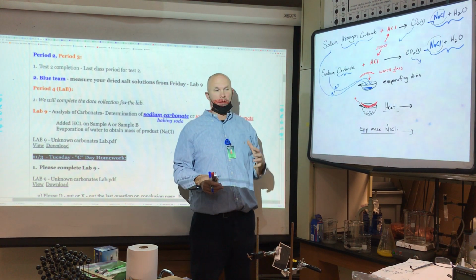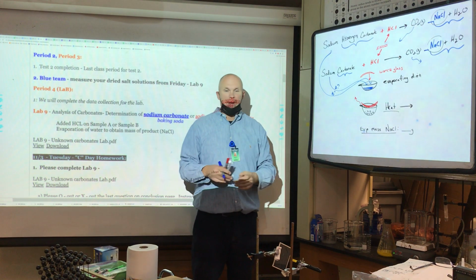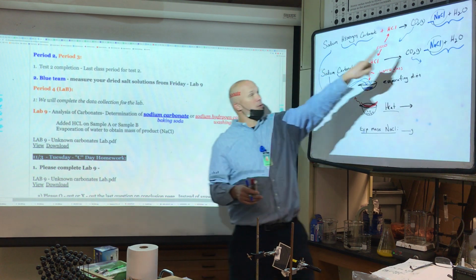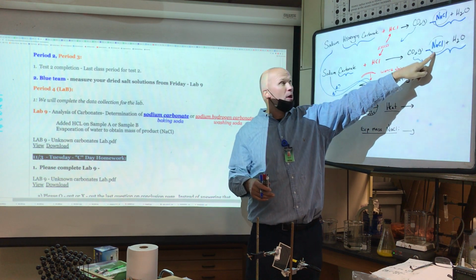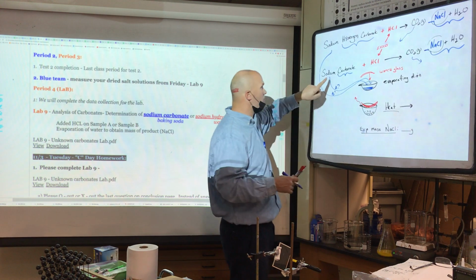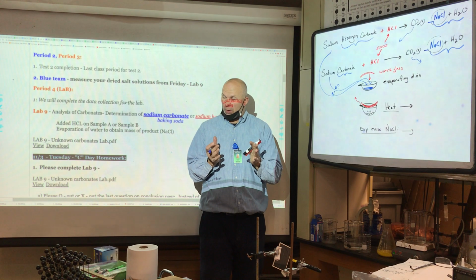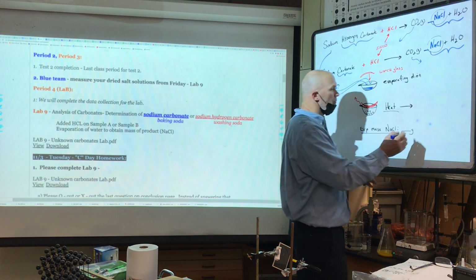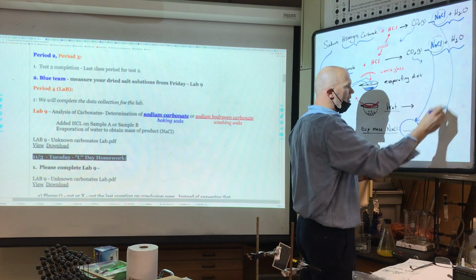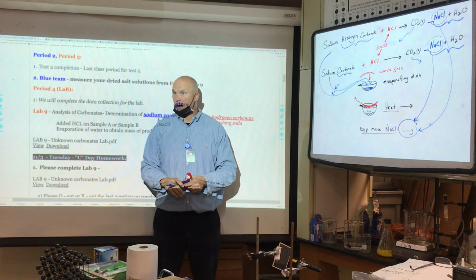Take the grams of your starting material after you subtracted out the evaporating dish, and then calculate using the correctly balanced chemical equation how many grams of sodium chloride I should produce, assuming it was that. And once you have those two masses of sodium chloride, see which one matches up best with this value here. It will be very close.